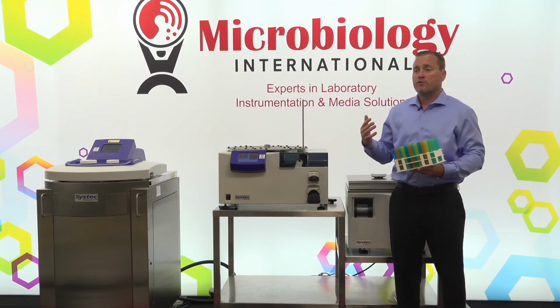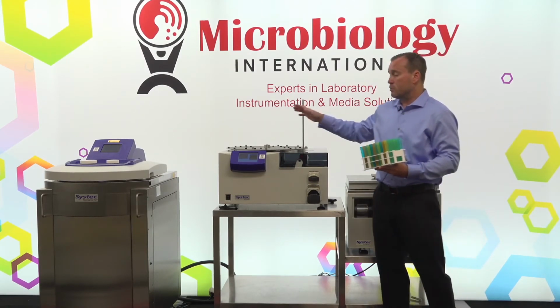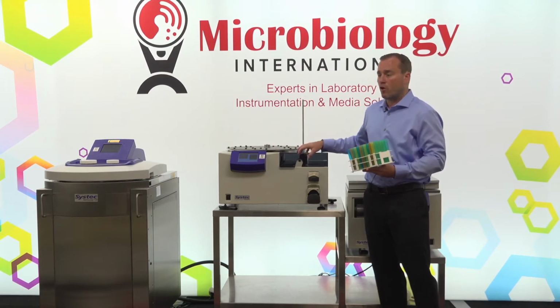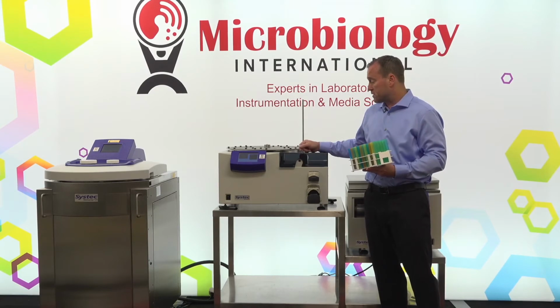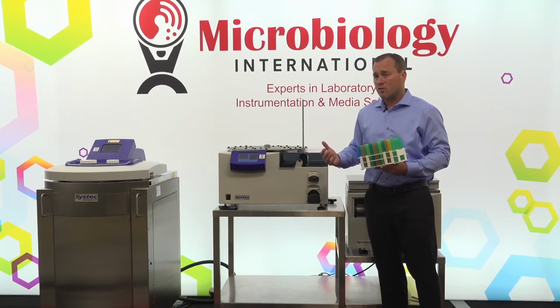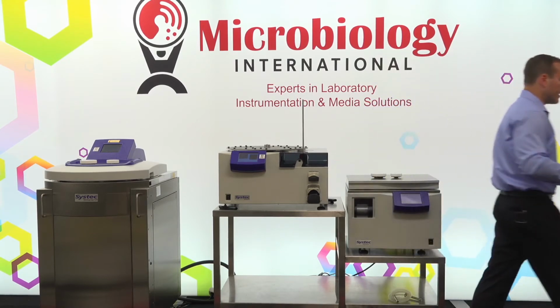So if you're doing a lot of 100 millimeter and a lot of 60 millimeter plates, then you would just simply have 2 carousels, 2 revolvers, and then the little feet that lift the plates for the stacker and the feeder piston would need to be changed. Also a very simple process, less than 5 minutes once you're familiar with the application.